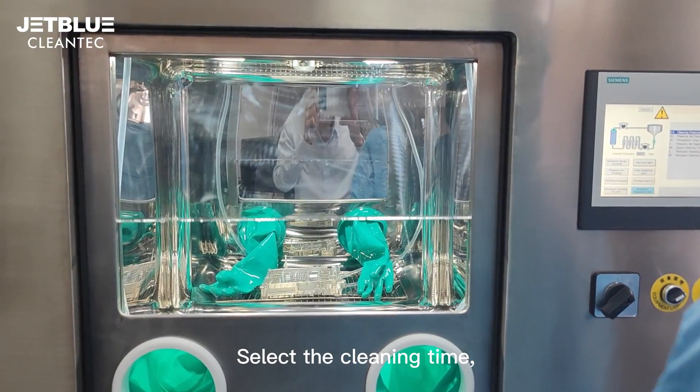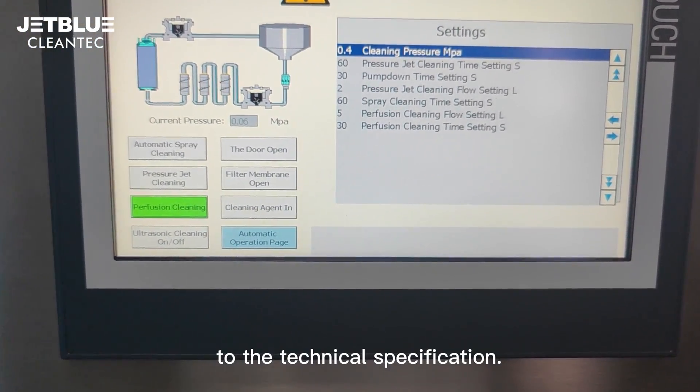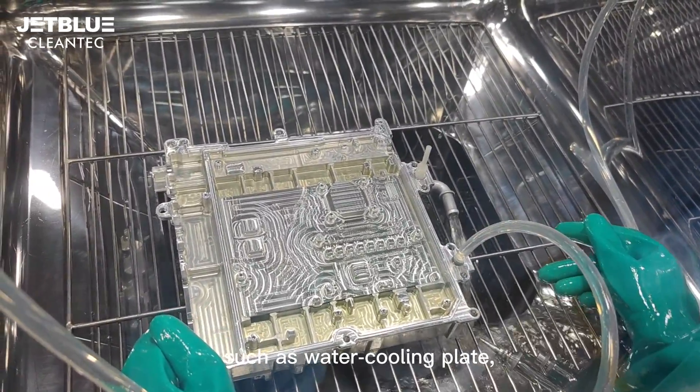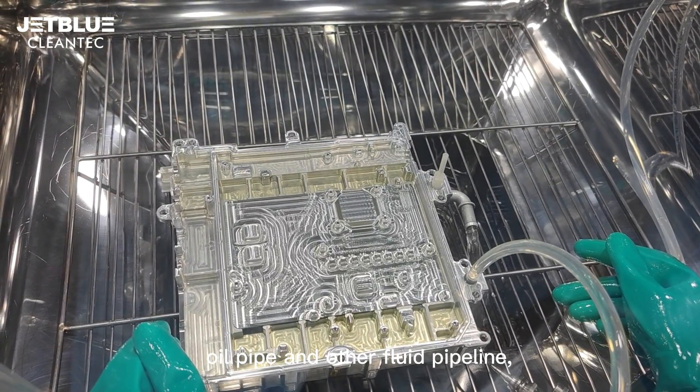Select the cleaning time, cleaning flow, and cleaning pressure according to the technical specification. This method is used to inspect the technical cleanliness of the inner wall of workpieces such as water cooling plates, radiators, heat exchangers, soil pipes, and other fluid pipelines.